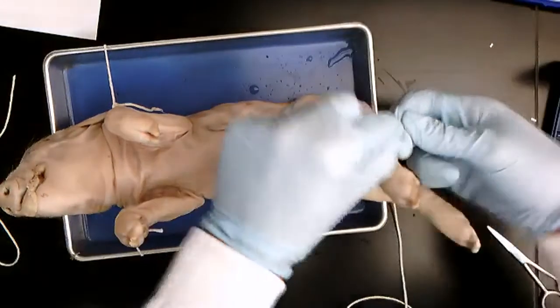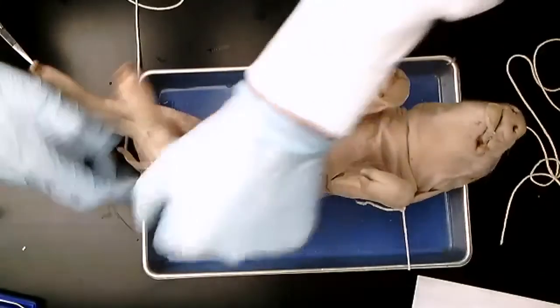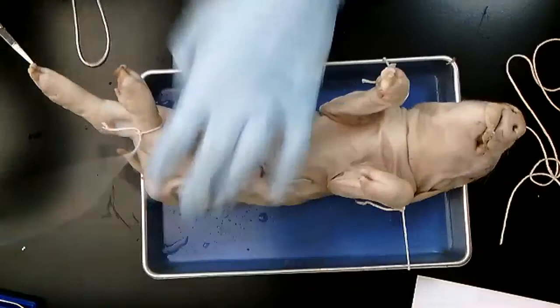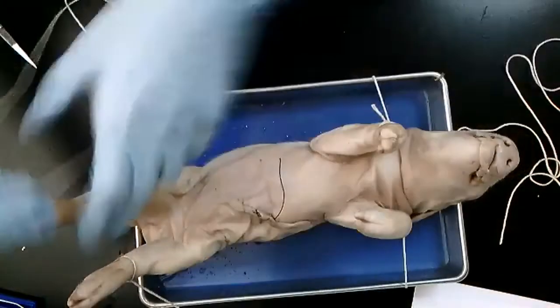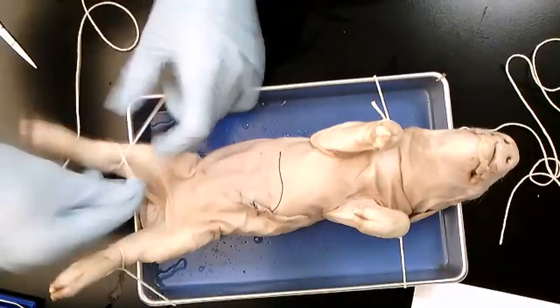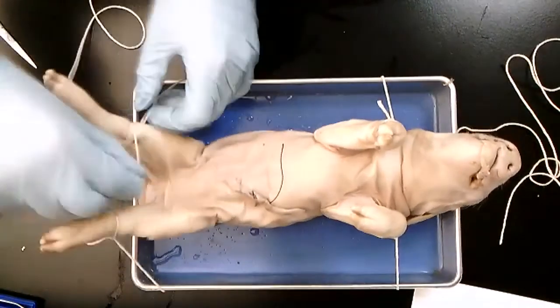Put this camera back around so it matches when you're looking on the screen. Sorry if I'm getting you guys dizzy here. So. And I took the string and just wrapped it under the dissection tray. And once I get it all done, that'll help spread the legs out some.